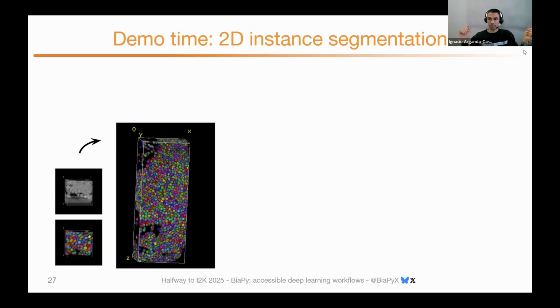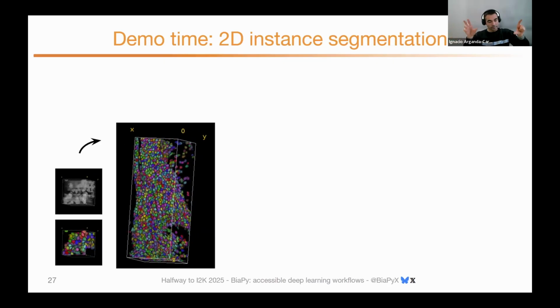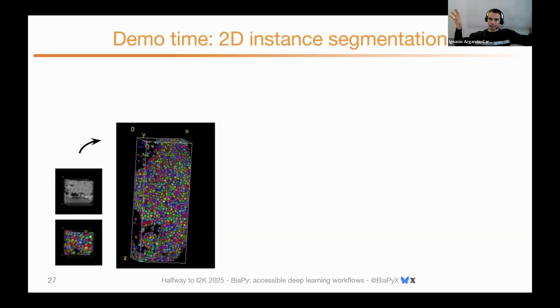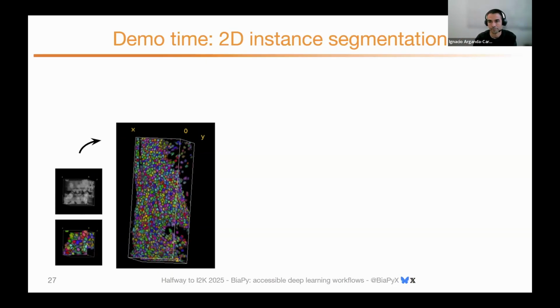This is something that we're exploring too, because it's simpler, as Danny said. If you want to apply this in a generic way without knowing anything about the images, to create different strategies based on how you represent the instance segmentation problem.